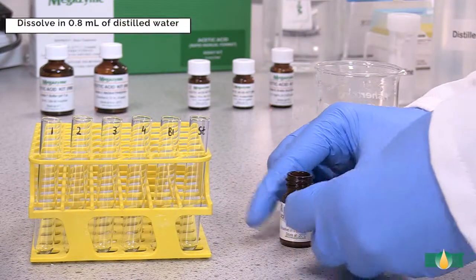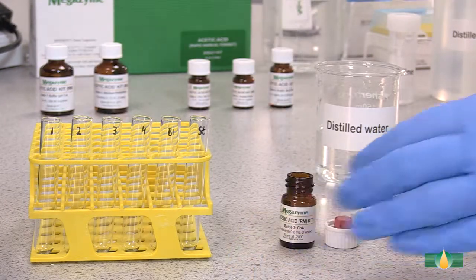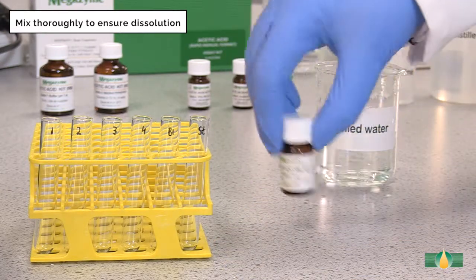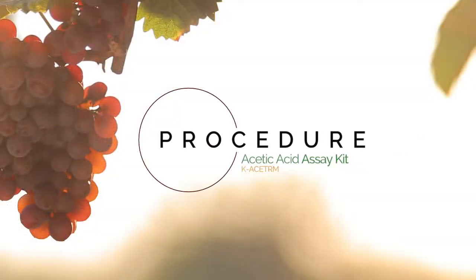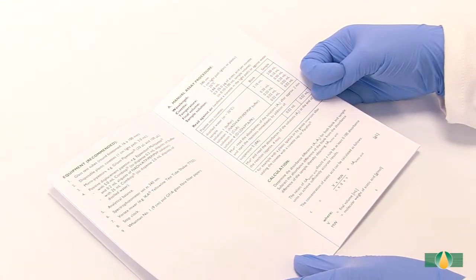The contents of bottle 3 are dissolved in 0.8 milliliters of distilled water. The bottle is capped and the contents are mixed thoroughly to ensure complete dissolution. For longer term stability, do not dissolve the contents of the second bottle until required. Follow the manual assay procedure as described in the data booklet.